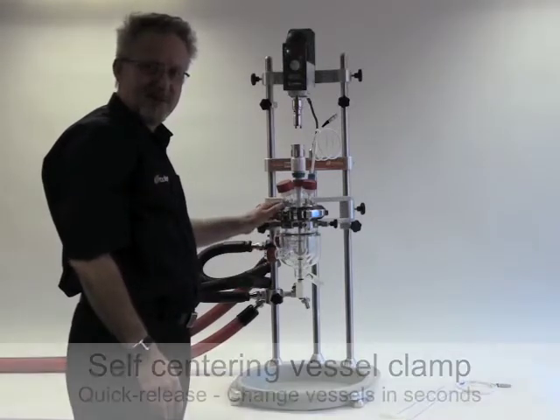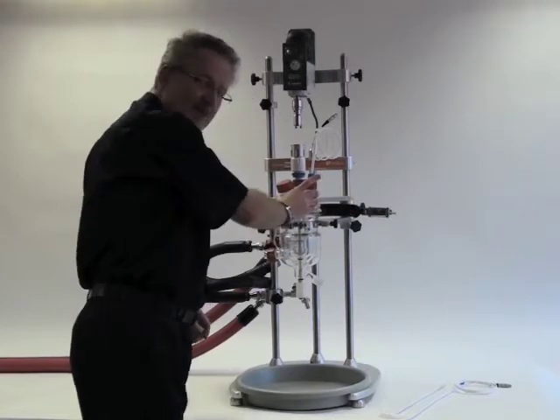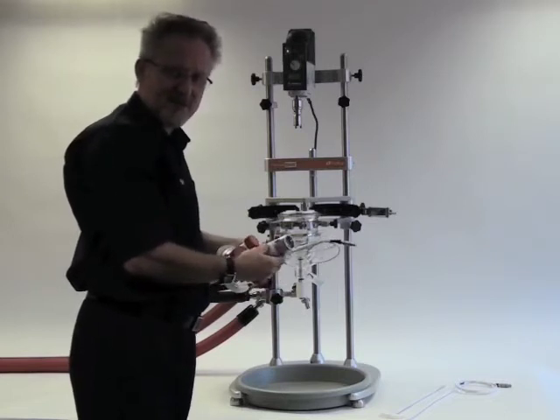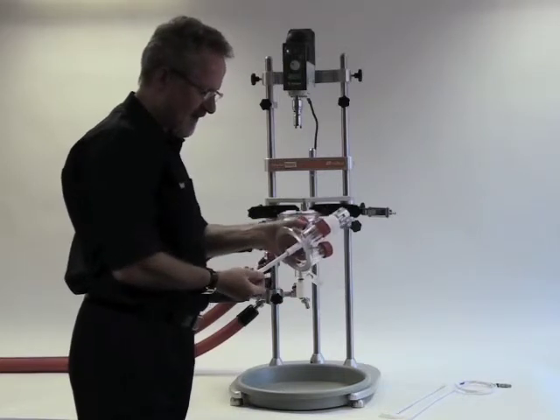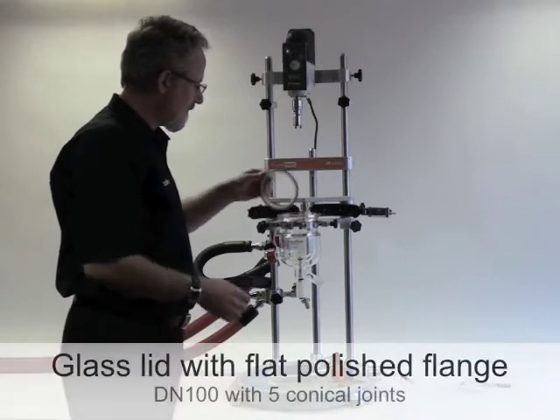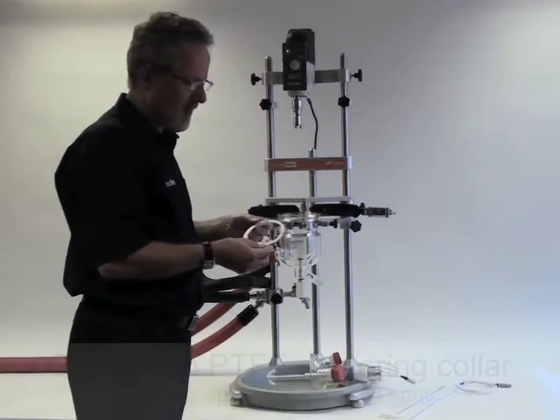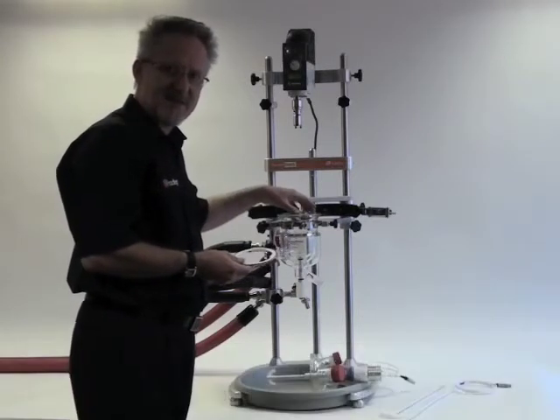Now I can undo the vessel quick release clamp and remove the lid. This is the PTFE stirrer guide which provides a rotating seal on the stirrer shaft. As standard we offer an anchor stirrer shaft, and also available are a retreat curve impeller and pitch blade turbine. With Reactor Ready we're using a flat polished flange and an FEP encapsulated O-ring which is centred by this PTFE collar.